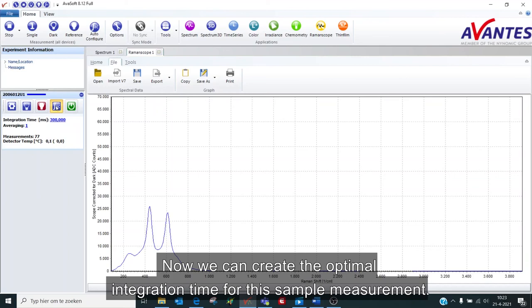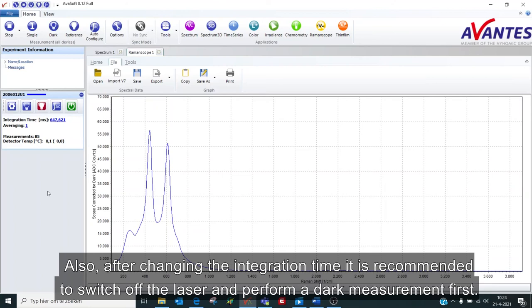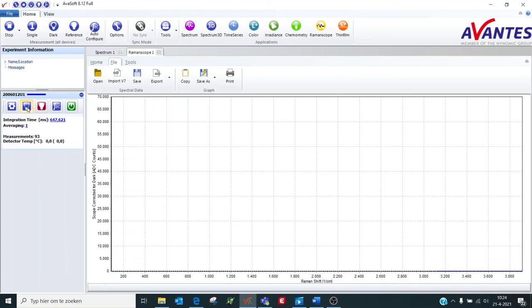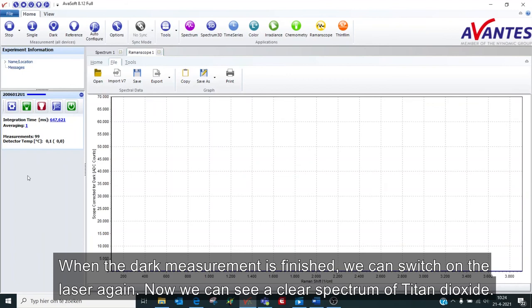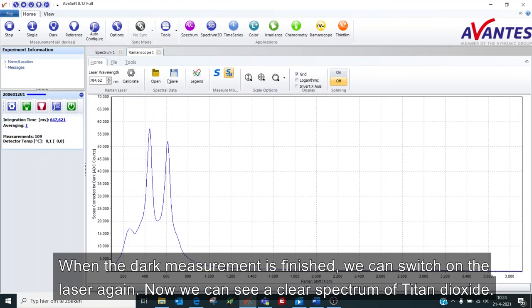Also, after changing the integration time, it is recommended to switch off the laser and perform a dark measurement first. When the dark measurement is finished, we can switch on the laser again. Now we can see a clear spectrum of titanium dioxide.